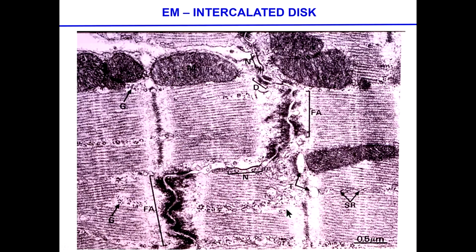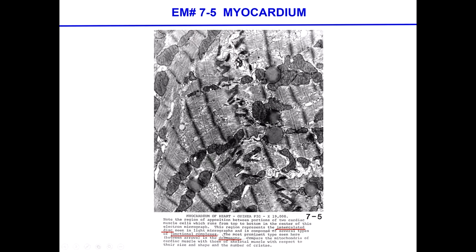Oh, going backwards again. Okay, so this is another structure, and the idea is to see the junction between cells once more. You see this tortuous road that is going around here. It's going all this way, again, simply to show you how heterogeneous, in a way irregular, the junctions are between the cells.